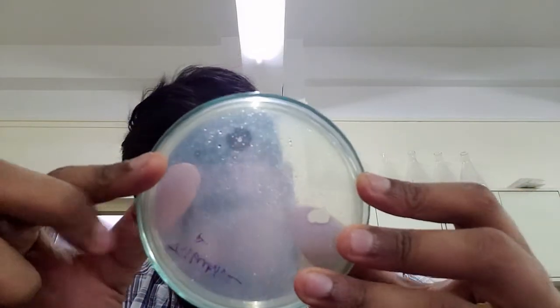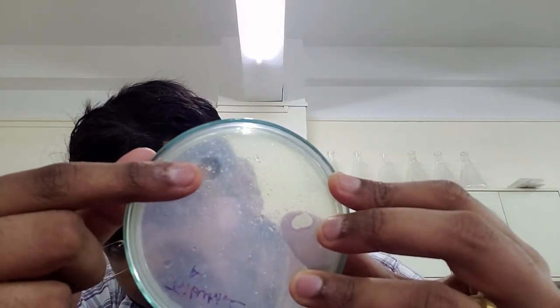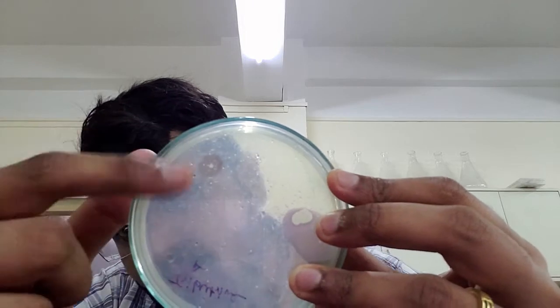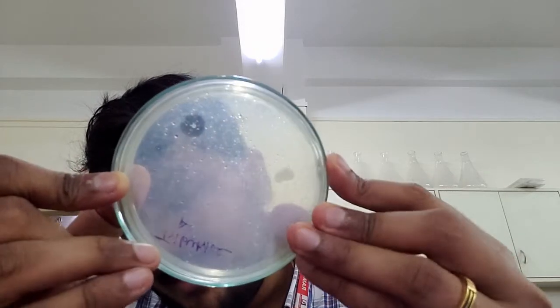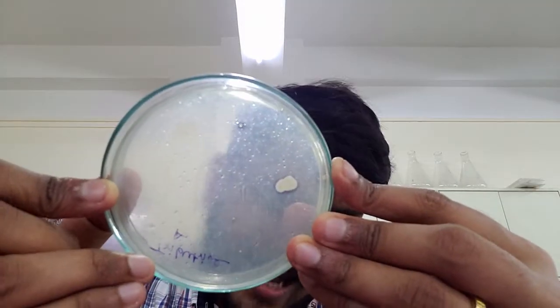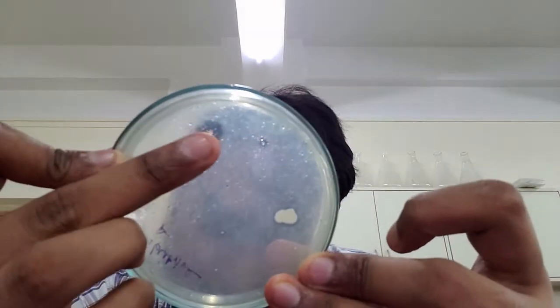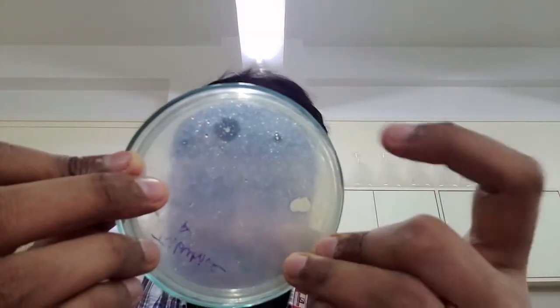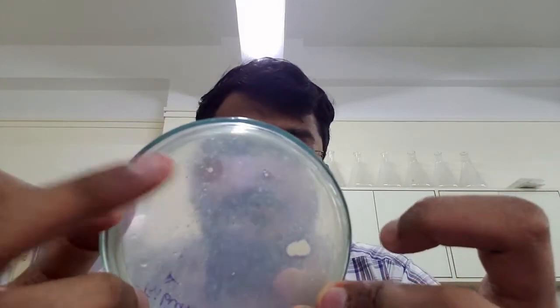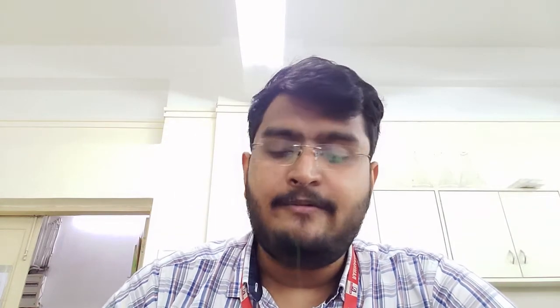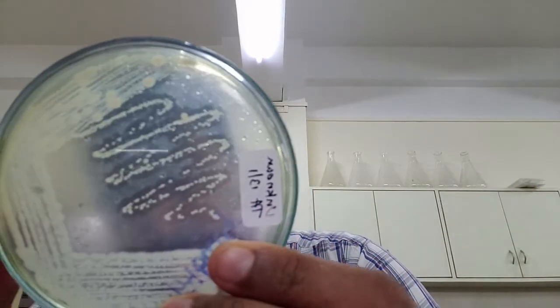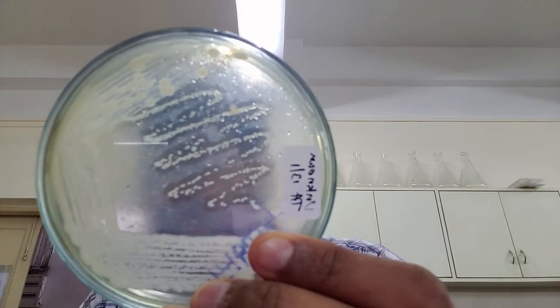This was the air-exposure plate kept in the open, and you can very evidently see that around this particular colony there is a good zone of clearance. The bigger colony also shows slight clearance, but not as evident as the other colonies. This plate was what I had tried to purify on tributyrin agar again, but it still seems to be a mixed culture. We can purify it further and look for the yield of lipase, since the clearance is very evident here.